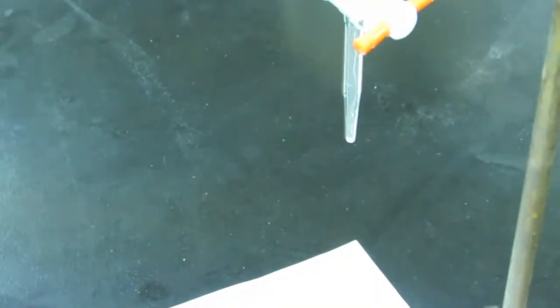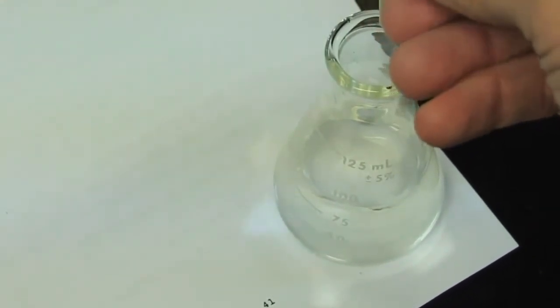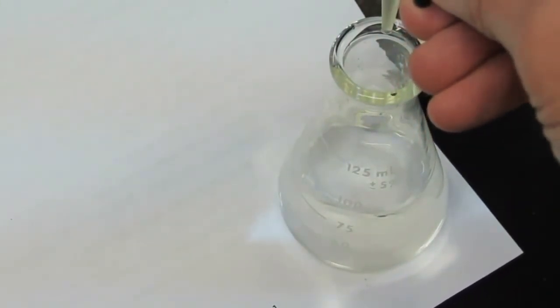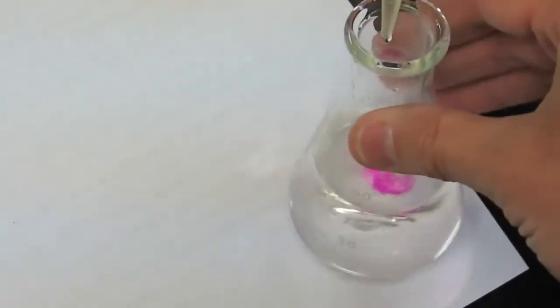Okay, now I passed it again. No big deal. We'll go back to our acid. And I'm just going to add a couple of drops. I'm very close to my endpoint here. All right, now we're going to add our base drop by drop. And we'll see what we have here. There we go. There's 3 drops and a hanging drop. We'll touch the side and catch that.